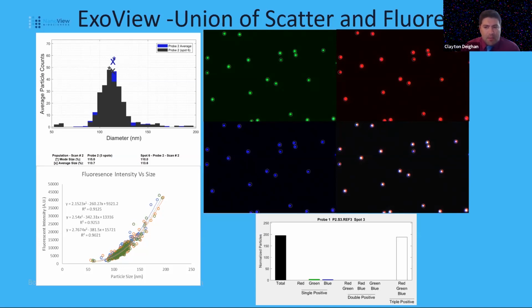And then perhaps the most important part for what we're going to talk about here, when we run this control and we look in the plot on the center of the right at the bottom, for the colocalization aspects of this sample, when we look at these beads, we only have one phenotype, and it's the phenotype that all of the beads are fluorescent for all 3 colors.